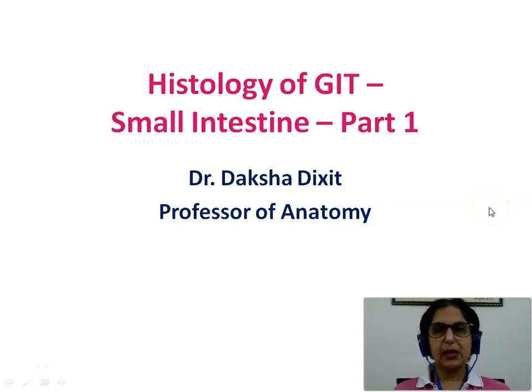Hello friends, today we will be studying Histology of Small Intestine Part 1. In this video, we will be doing the general features of Histology of Small Intestine, and we will be studying one important slide, and that is of Histology of Duodenum.